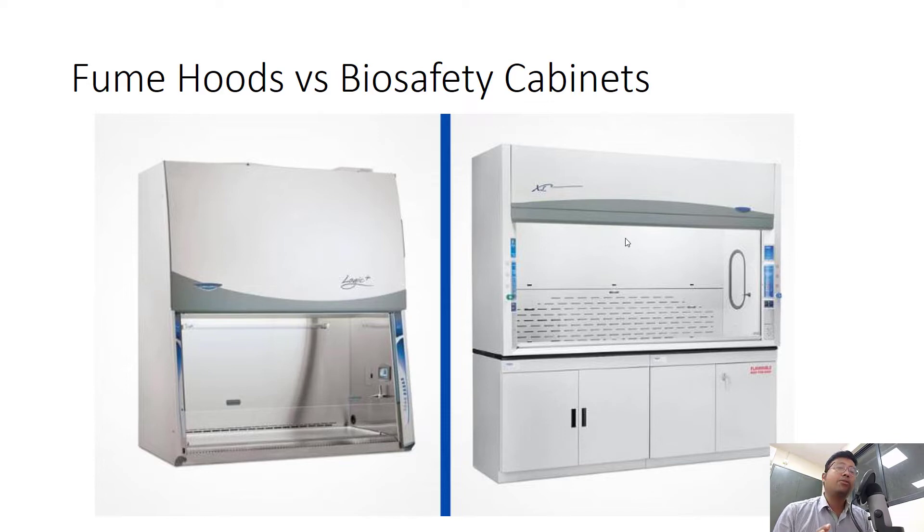I hope you have already answered in the comments. Now let me tell you — the one on the left, on which I am hovering my cursor, is actually a biosafety cabinet, and the one on the right is a fume hood. Basically they look more or less the same, so what is actually the difference?